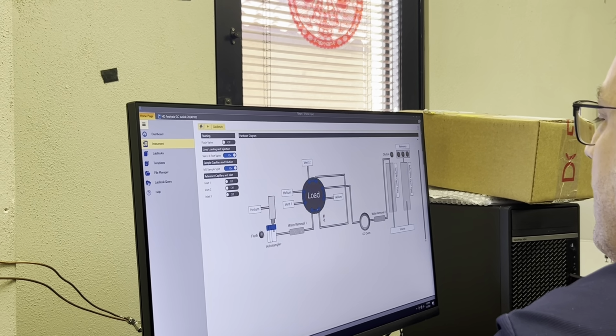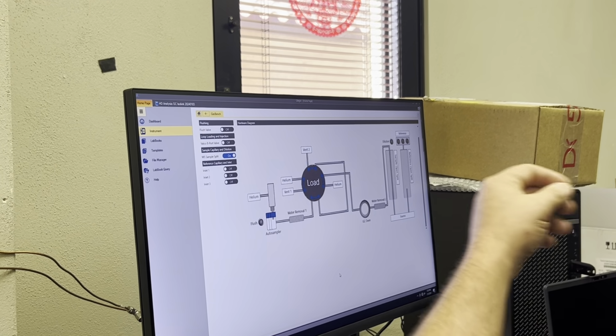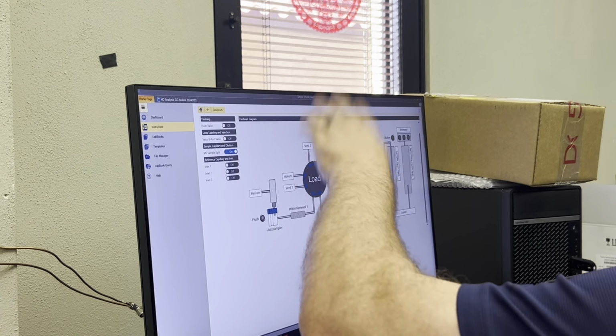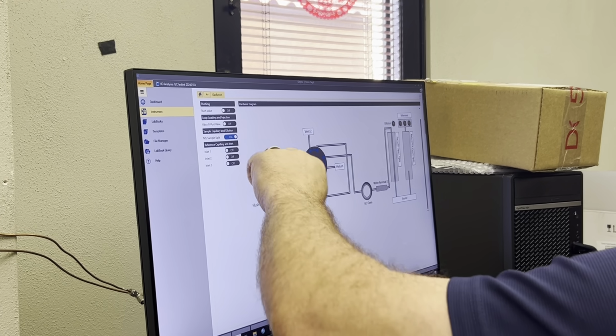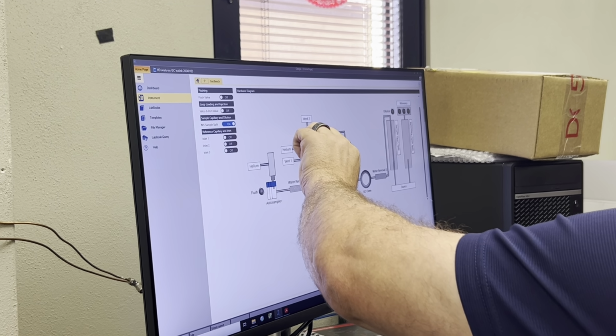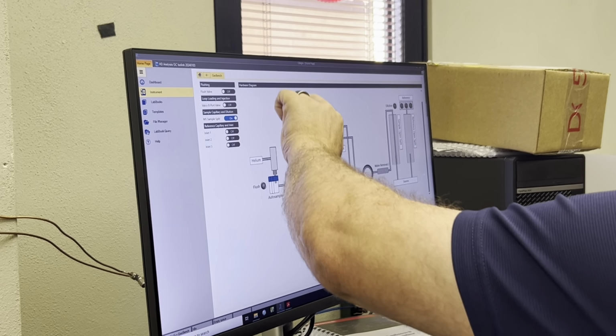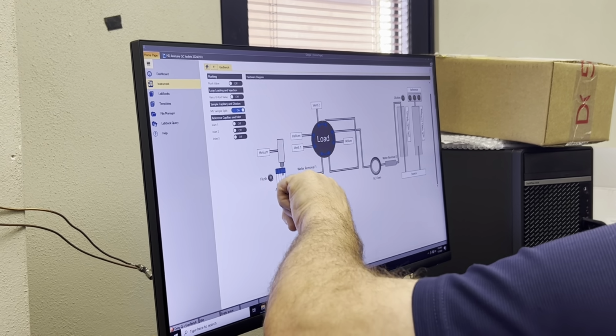In this case, you're diluting it with helium because you're pushing helium through the system. But it's helium mixed with your sample, and that will come through here and fill the loop. Any excess will go to atmosphere, but this is a mixture of the helium and the sample.